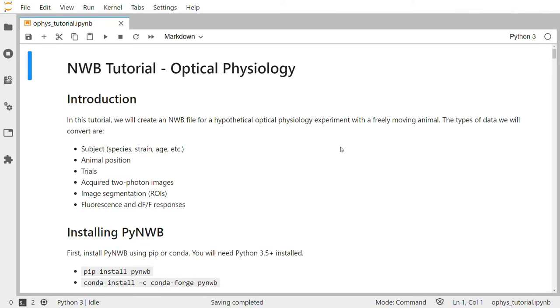First, in order to work with NWB files in Python, we need to install the PyNWB software. We can do that using PIP or Conda. You will need to have Python 3.5 or higher installed. You can use these commands to install PyNWB from the PIP package manager, or if you prefer, you can install PyNWB from the Conda Forge channel in Conda.